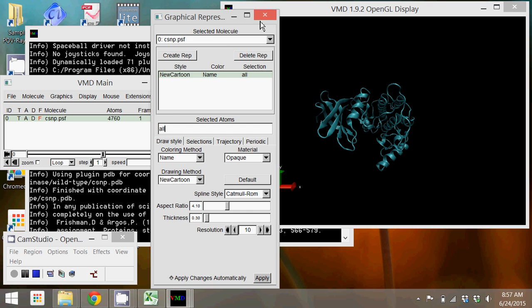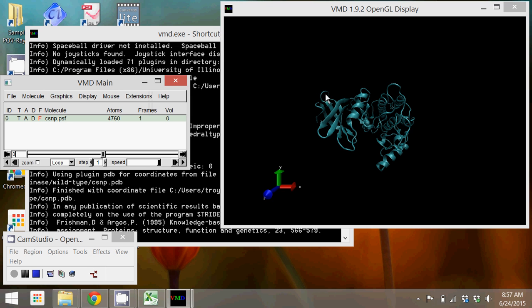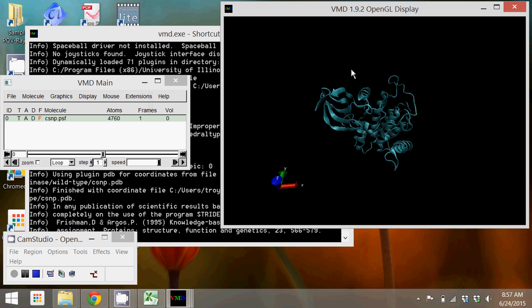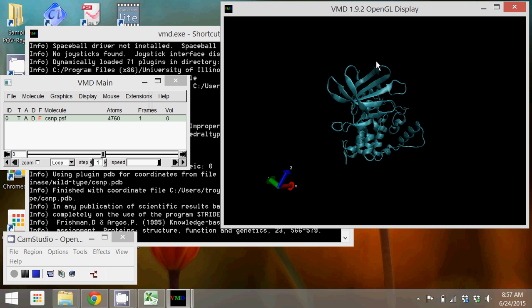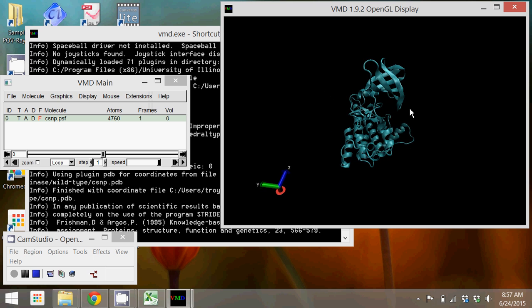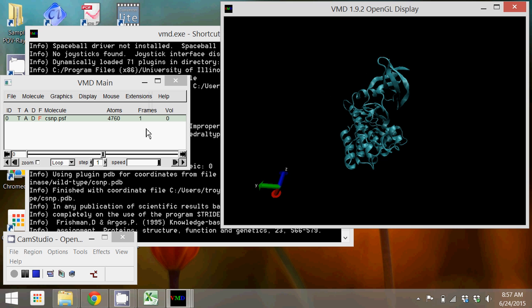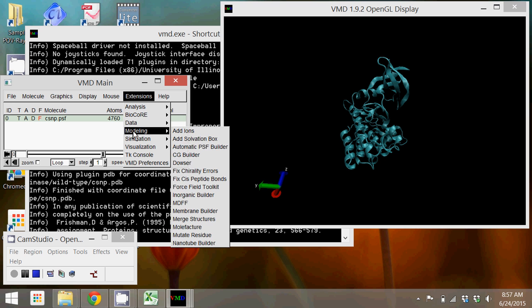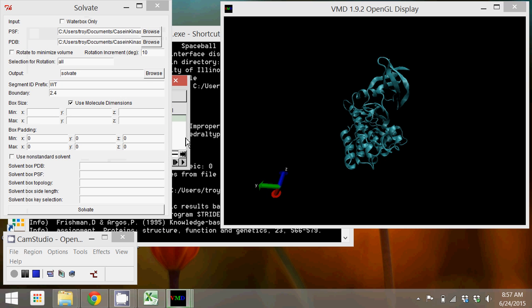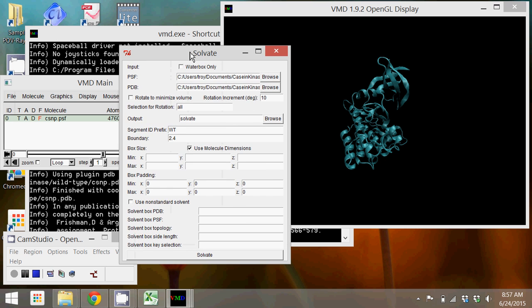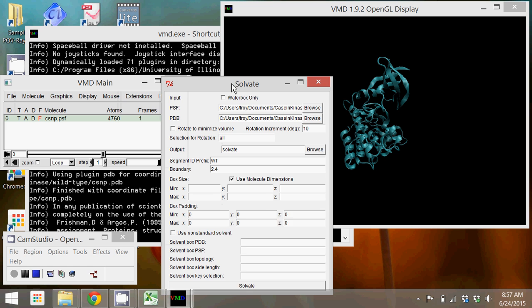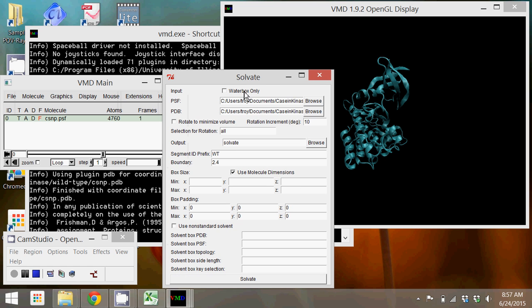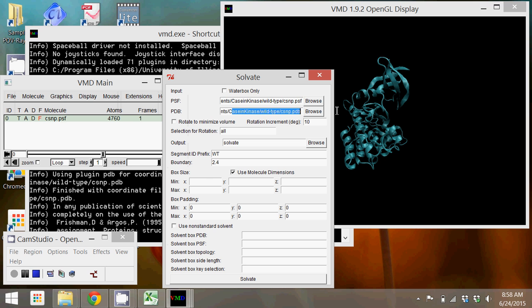And the next thing that I will do is in the main window under extensions again, go to modeling, add solvation box. Now that we have the structure loaded, it will automatically detect the structure file and the PDB file and it's going to create output files given whatever name you put in this output box.